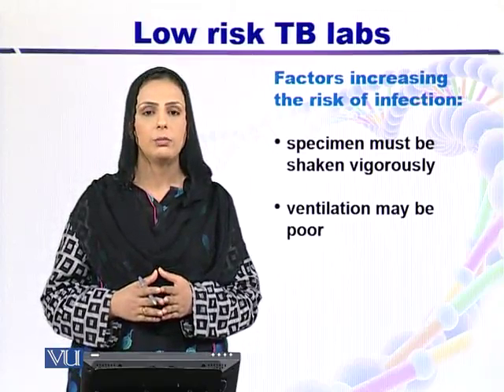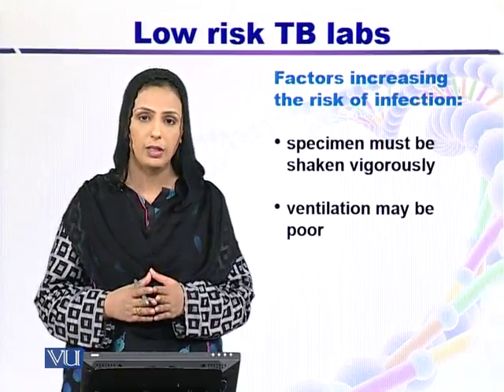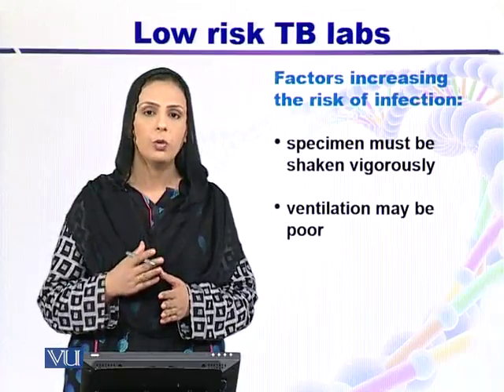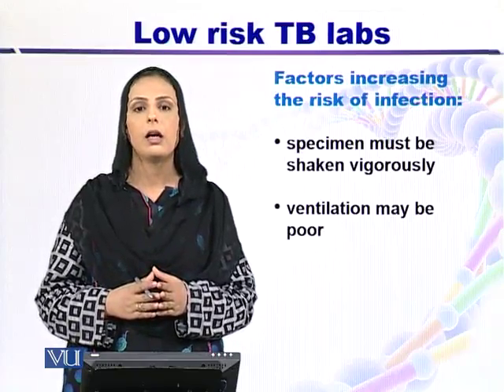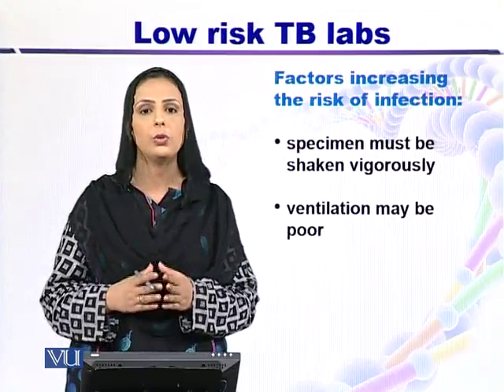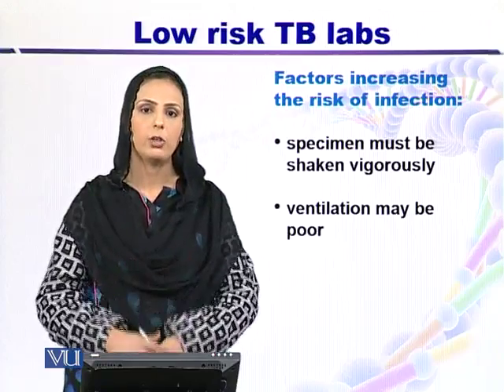Then ventilation may be poor, due to which the risk of infection increases. Keep in mind, for the low risk lab, directional flow of air is required. So a mechanical ventilation system is there, but if the local climate is appropriate, then you can use natural ventilation by simply opening the windows of the lab.